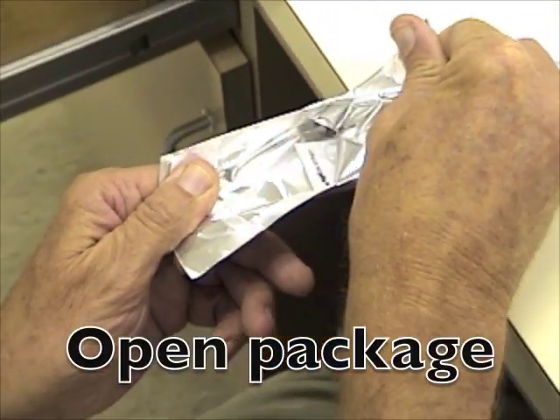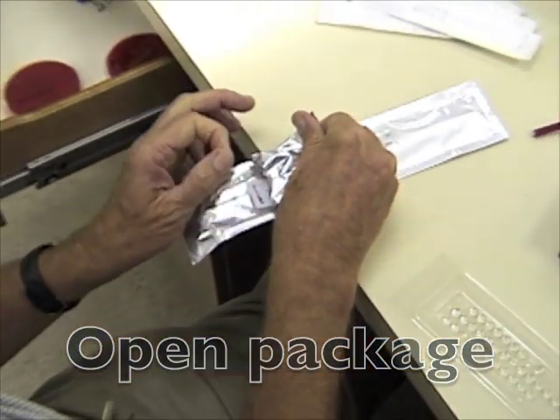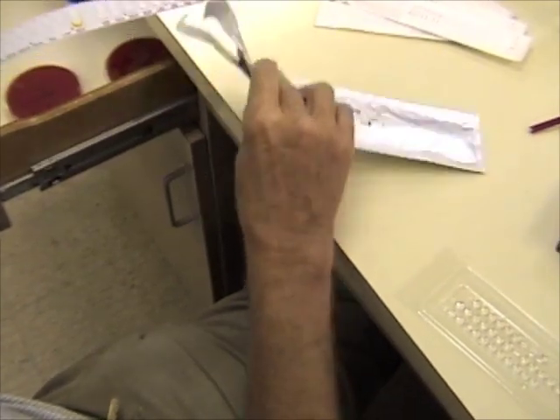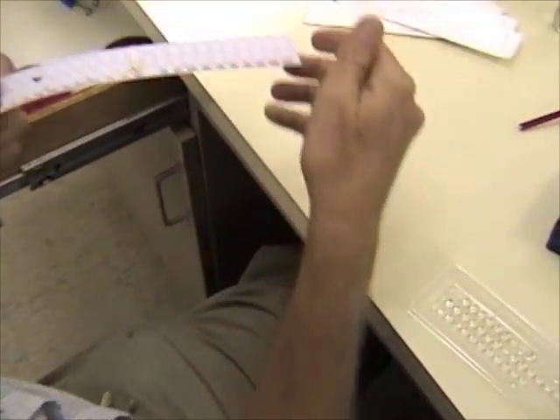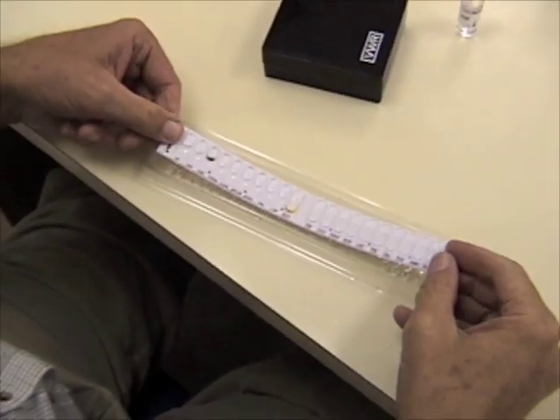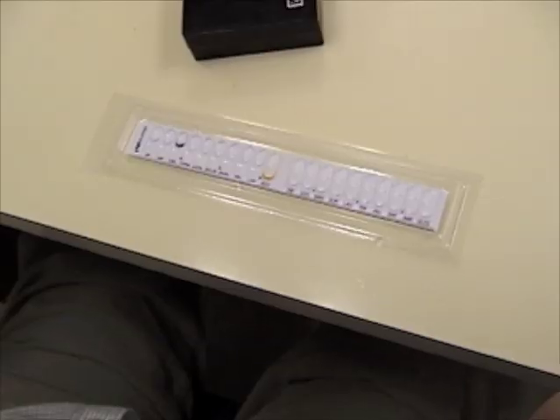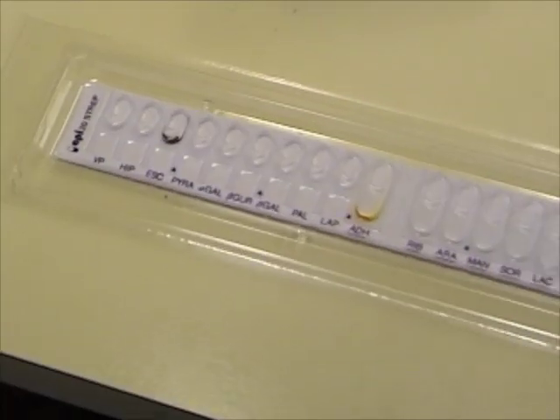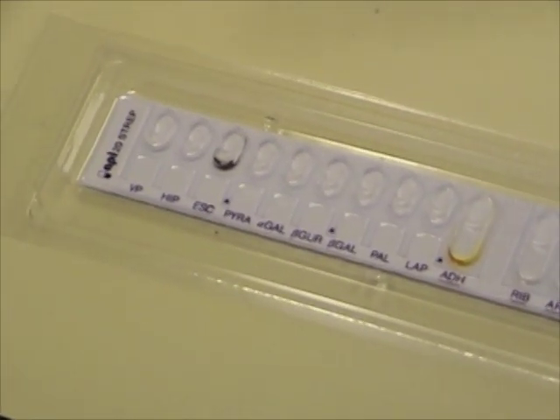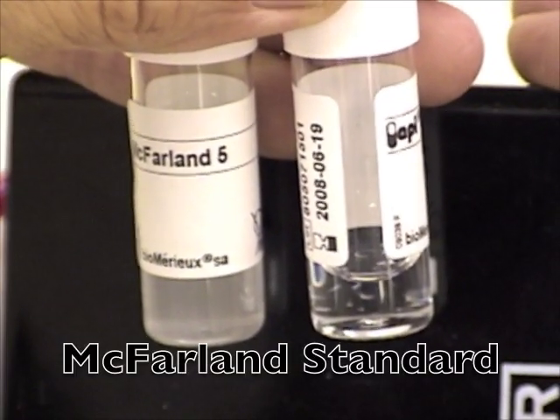Then open your package that has the strips. These strips are dry, and many of the tests are simply enzyme tests, and others of the tests are fermentation — that is, testing whether your organism grows on glucose or whatever.